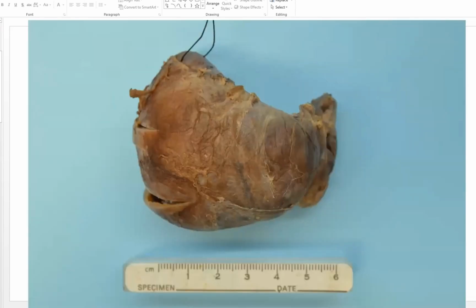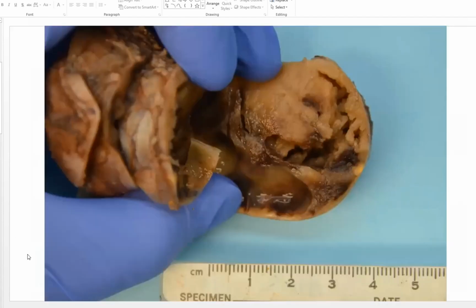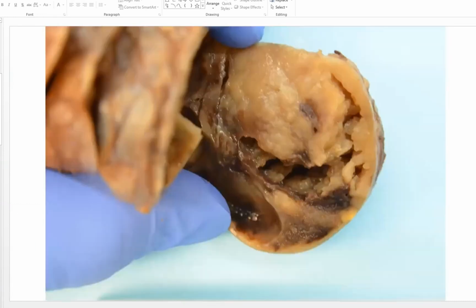And then this asymmetrical third sample here on the posterior aspect, you can see the concavity here, where it would sit in front of the thyroid cartilage, showing this asymmetrically large one side. On the cut surfaces here, just this variegated, heterogeneous kind of look, this papillary type of excrescences that you can see on some surfaces, which is quite concerning.